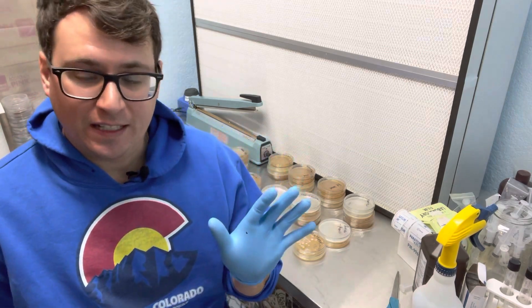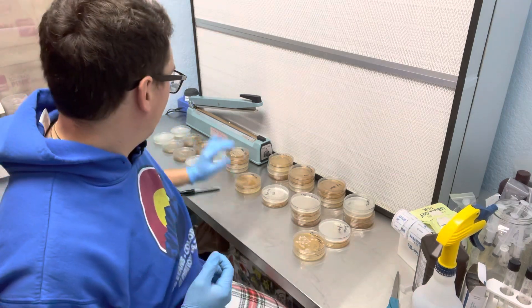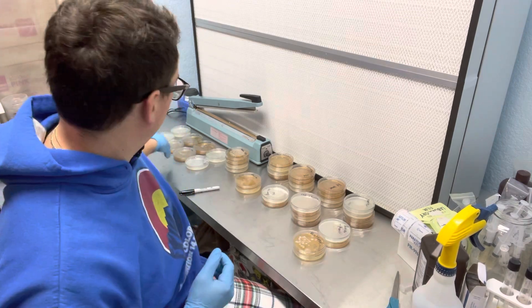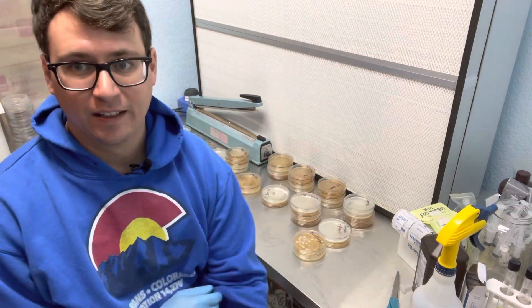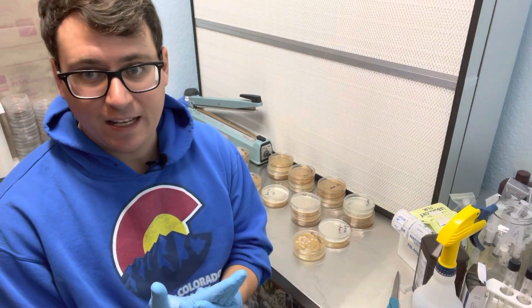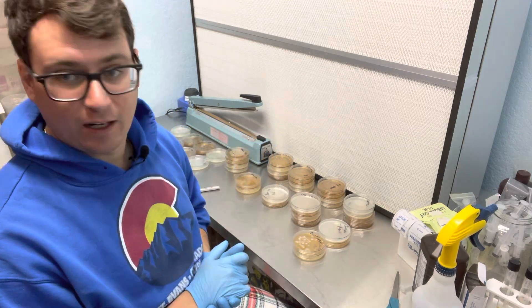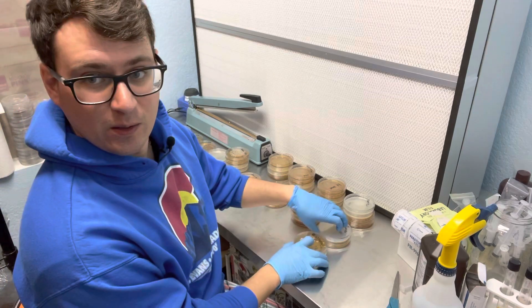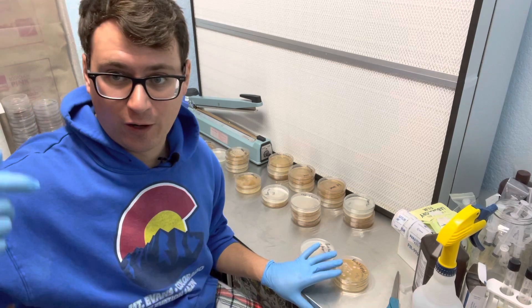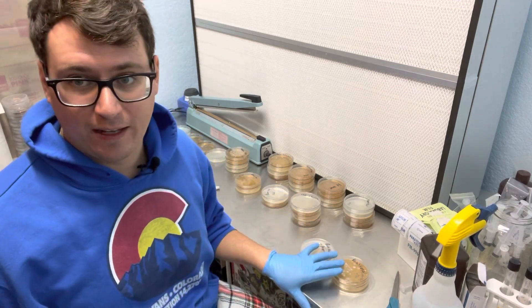It's been five days since we did all of our spore inoculations onto agar, and three and a half days for the redos that I did. I wanted to go over my plate reads at five days, so we've got some germinating spores that I wanted to go through. I also did some peroxide on those contaminated plates from the identifying bacteria video, so I'll go through that at the very end.